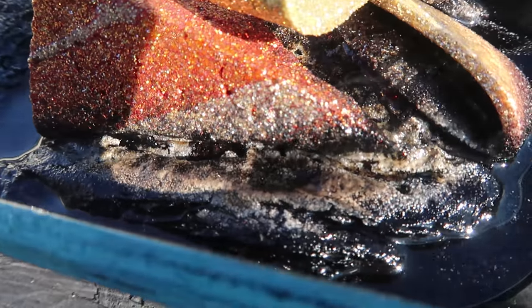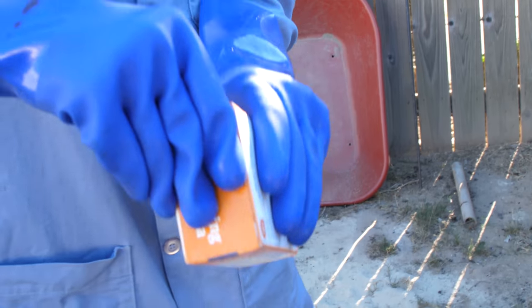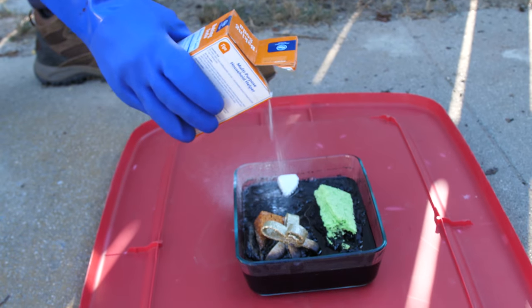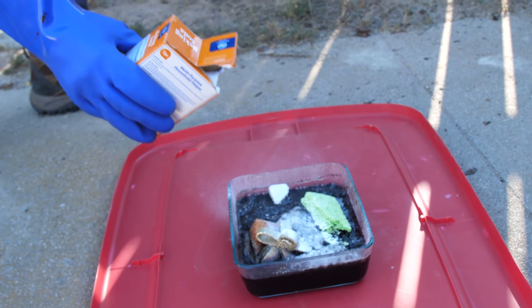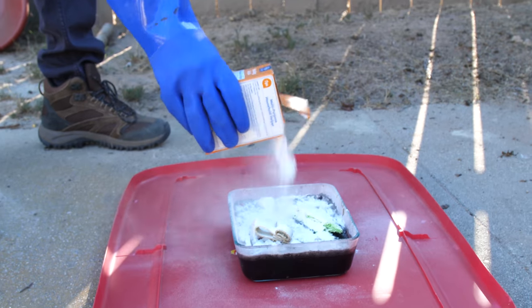So how do you dispose of this when you're done? I'll show you — it's really neat. The neutralization process: handy-dandy sodium bicarbonate, i.e. baking soda. You want to do this slowly, or else you'll have a little bit of a spillover. That smell, I feel like, never gets out of your nose.